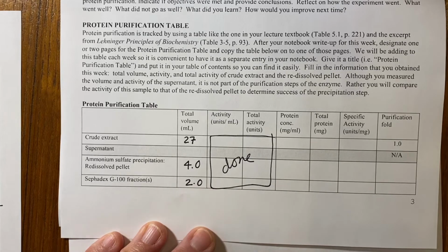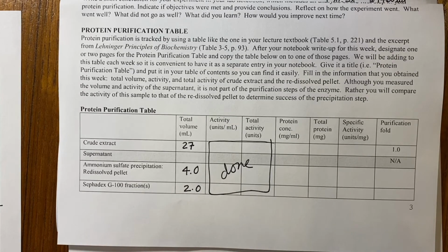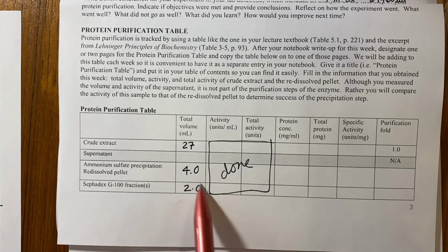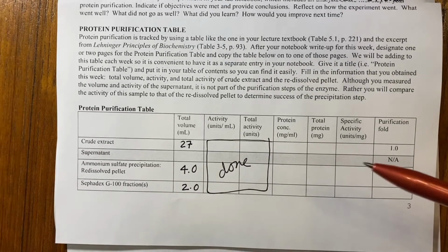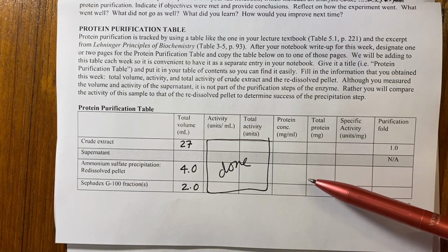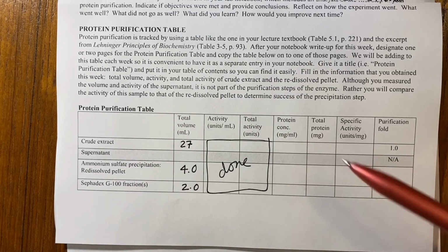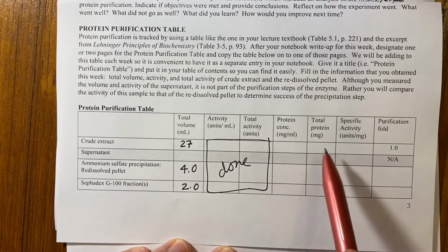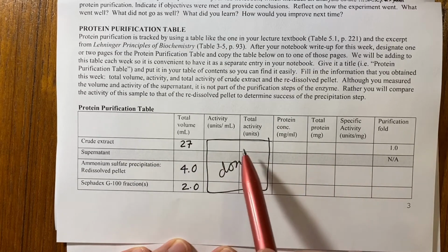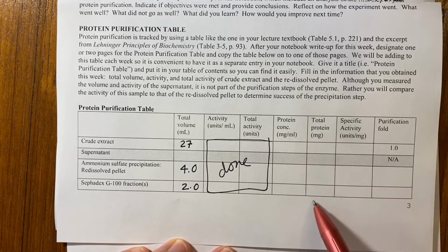So it's just the volume in that particular test tube. It's not the V0 or the volume to get to that test tube. It's just the volume of that test tube. So this should be 2. Okay, so the milligrams per mL that you calculated here for the crude, the pellet, and the Sephadex fraction goes here. And then you will take this total volume and multiply it by this to get this, just like you did over here. The total volume gets rid of the milliliters in this column, and you'll get total milligrams.